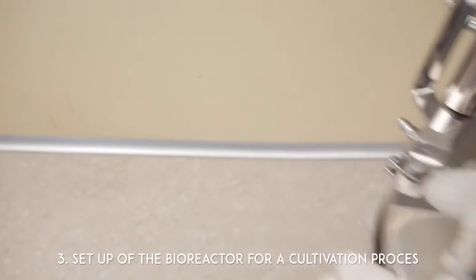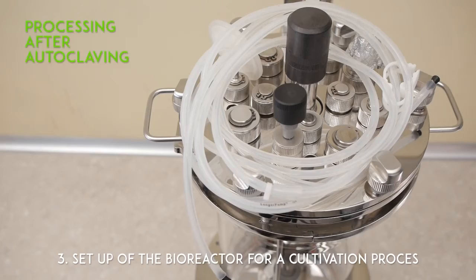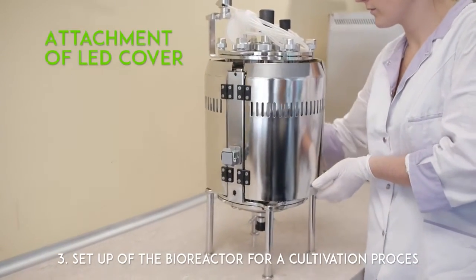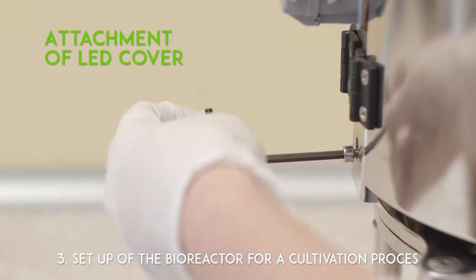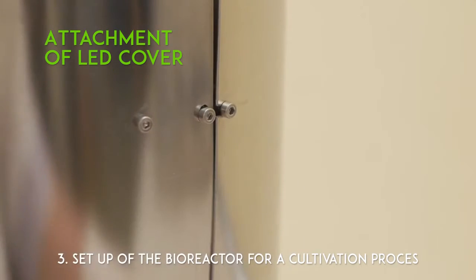Setup of the bioreactor for a cultivation process. Processing after autoclaving. Attachment of LED cover. Pay attention to the correct and precise attachment and connections of the accessories before the beginning of the process.